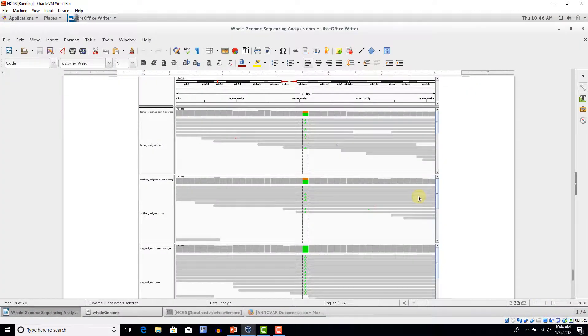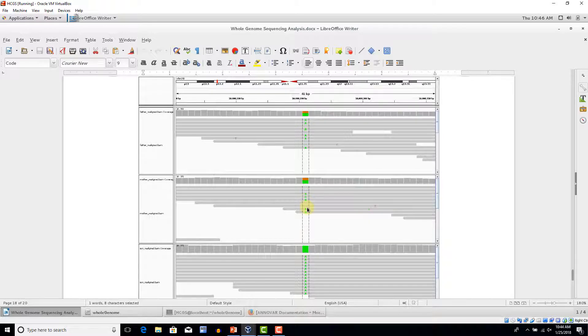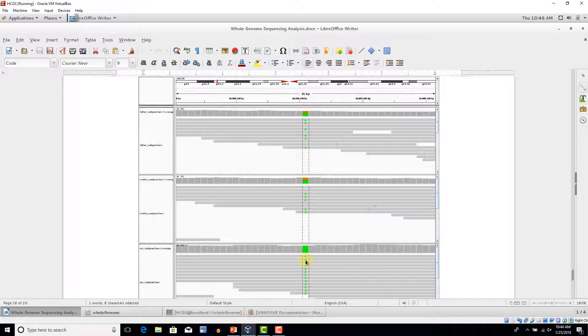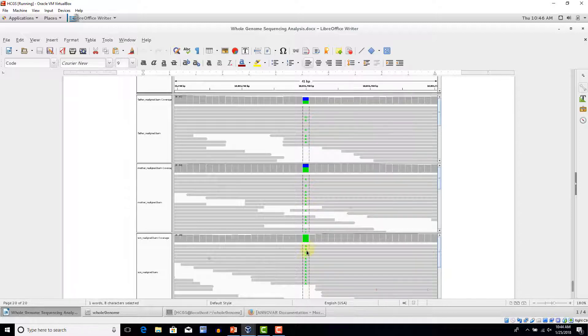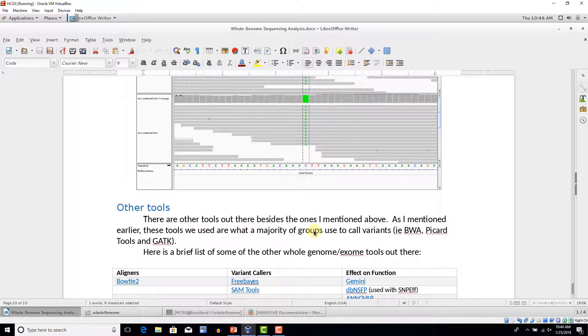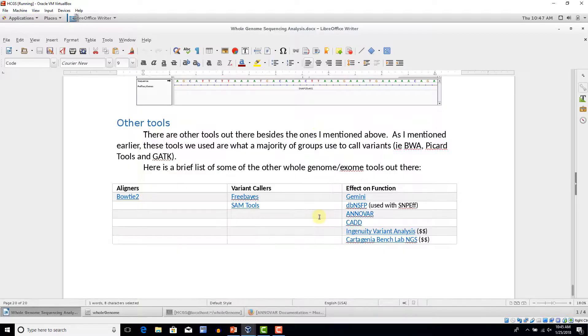If you have a Windows or a Mac machine, they have a simple icon now that you double-click and it opens it up. Whereas here in Ubuntu, or actually this is a CentOS machine, you have to call it at the command line. But you would load in your BAM files. Here is a screen grab of a particular autosomal recessive mutation. So the father is here, the mother is here, and the son is here. And you'll notice that both the father and the mother are carrying a heterozygous mutation where the son has the mutation as a homozygous mutation. Here is another one as well. A father has a heterozygous mutation at this location. The mother also as well. But the son has a homozygous, so autosomal recessive. So at the end of the day, when you have sifted through the output from Gemini or from some paid software company, to get your variants annotated and to then filter on allele frequencies, CADD scores, PolyPhen, SIFT scores, DANN scores, etc., however you feel comfortable filtering, I like to go back and look at those calls in IGV to make sure they look real. GATK does a great job at removing all the false positives, but there are times where things do slip through.